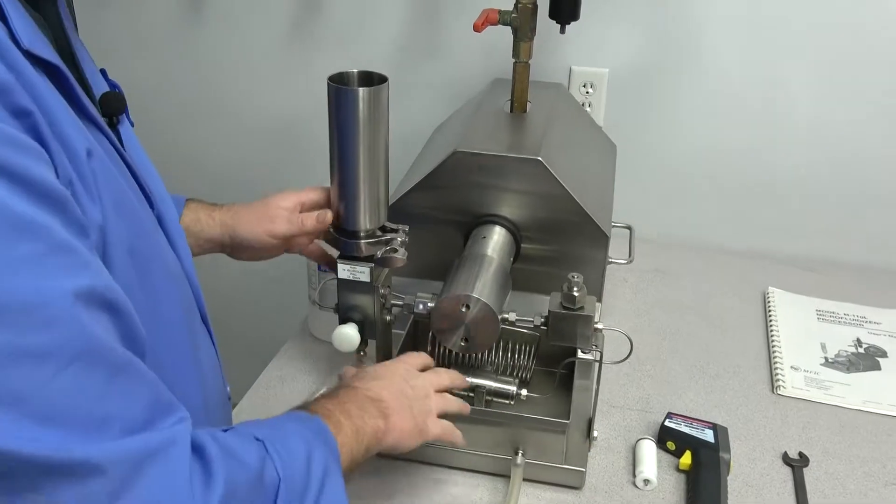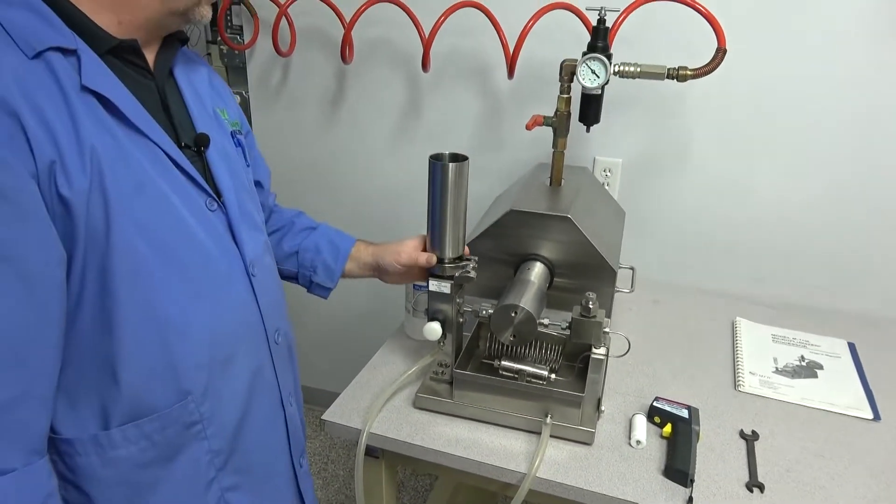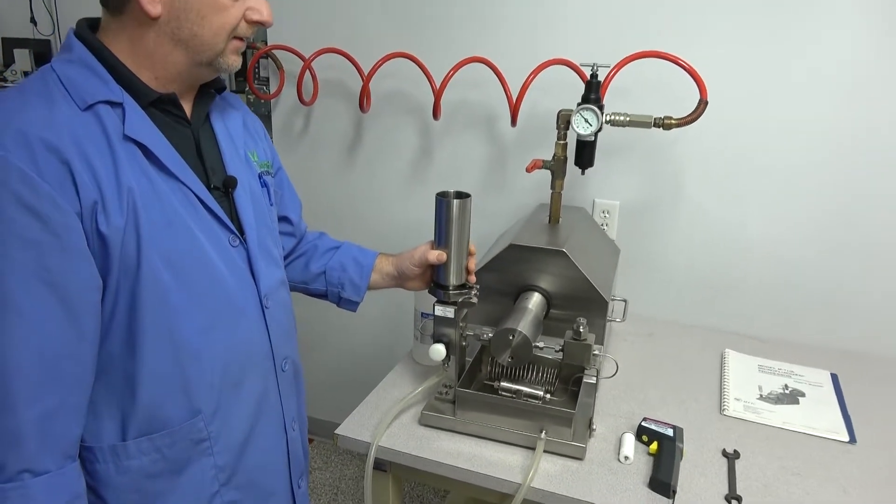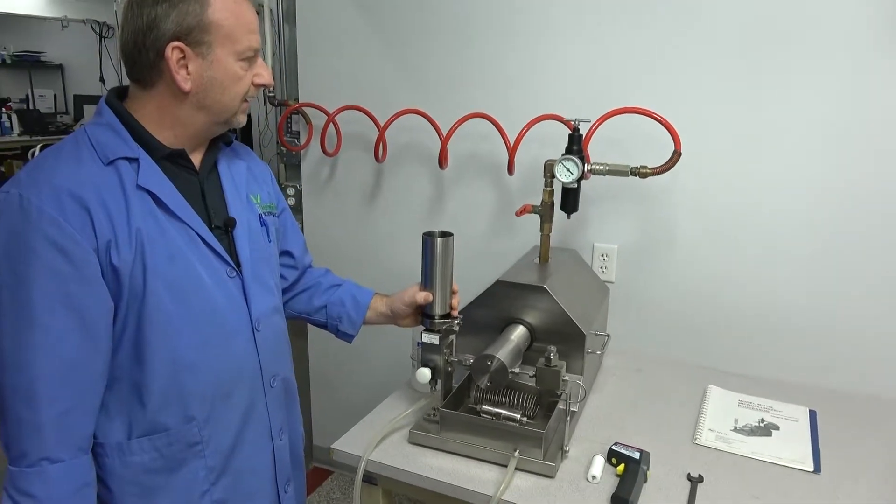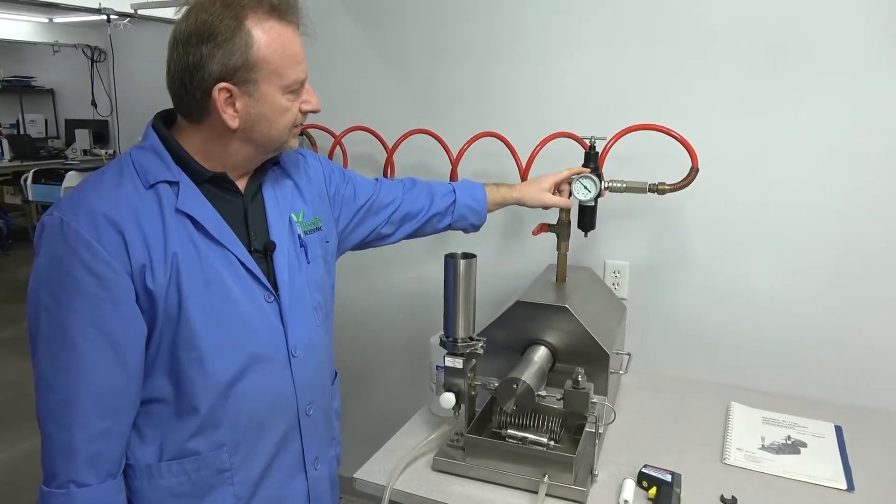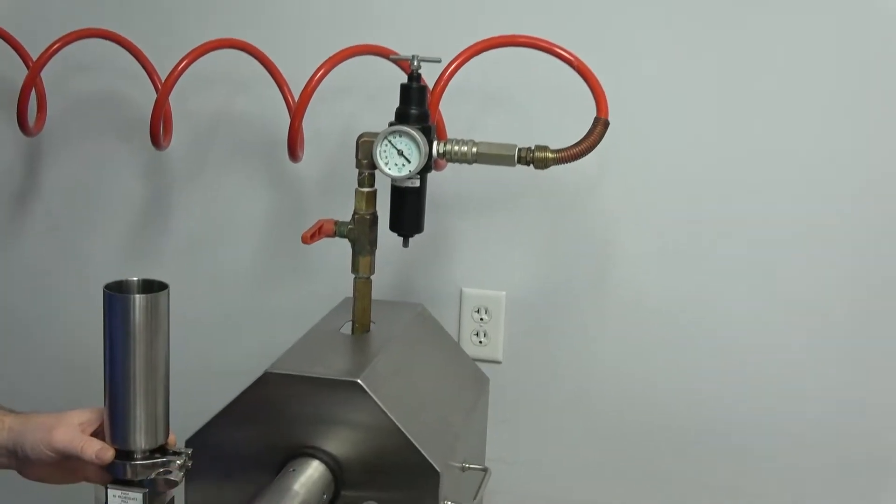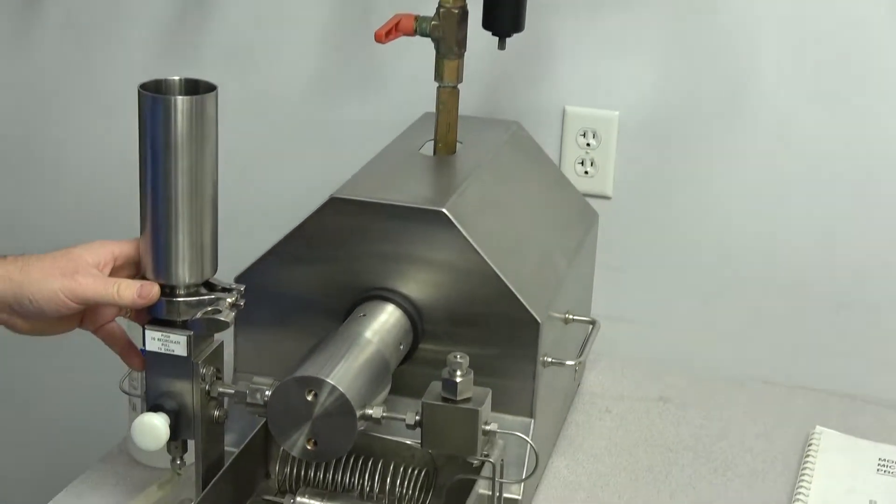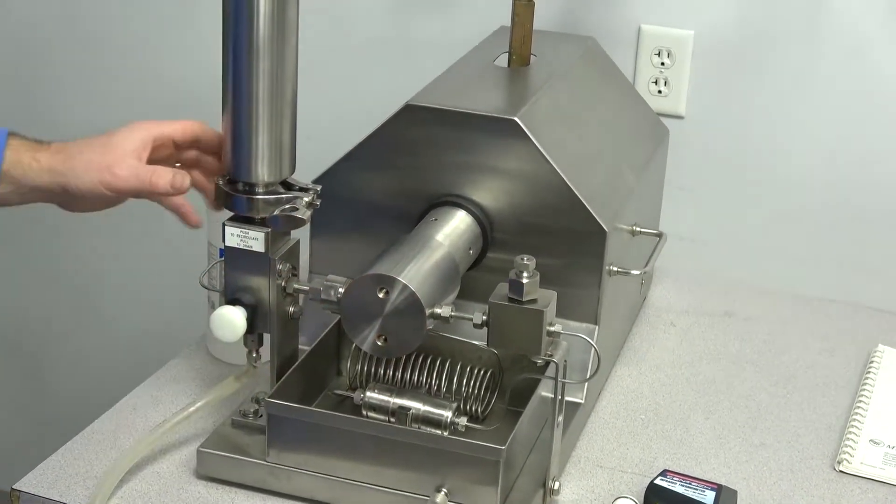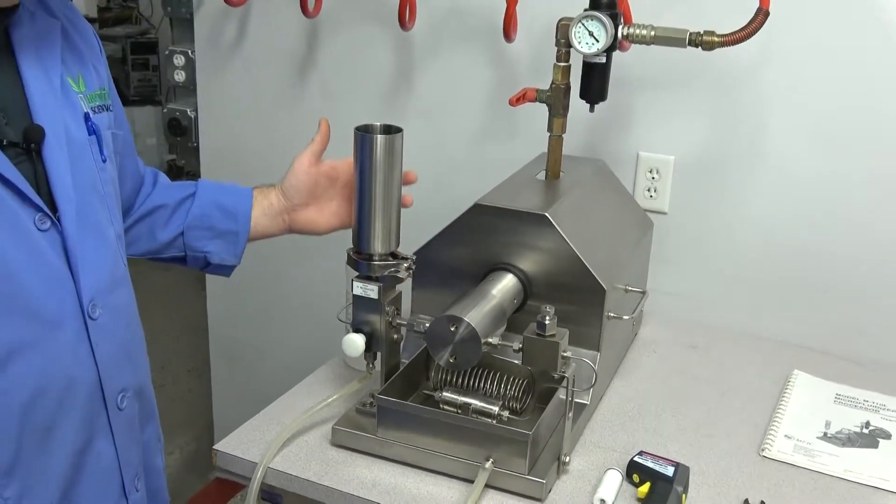We've purged it, we've purged everything, cleaned it really well. The integrity of the seals are all in great shape. The ball valve I should say is in great working condition. You can easily adjust your pressures here to adjust the pressures down here. But if you wanted to really fine tune it, you could put a pressure gauge down here to measure your high pressures to know a little bit more about your settings. But everything is in great shape.